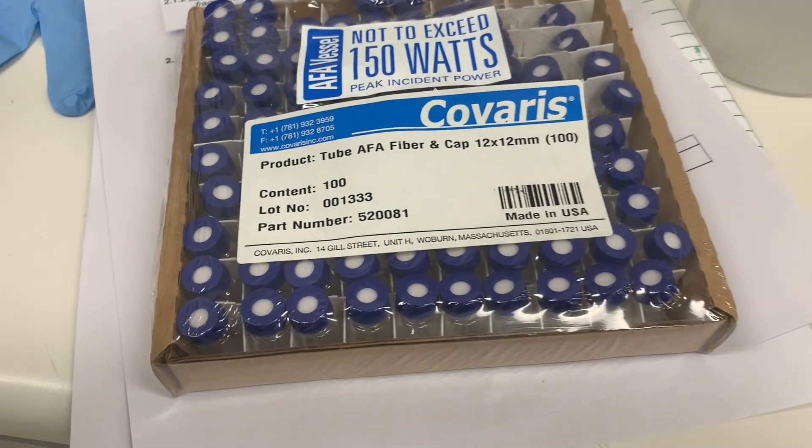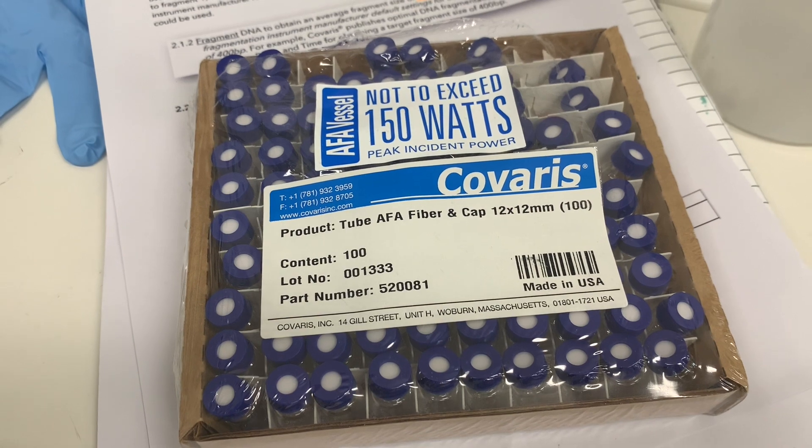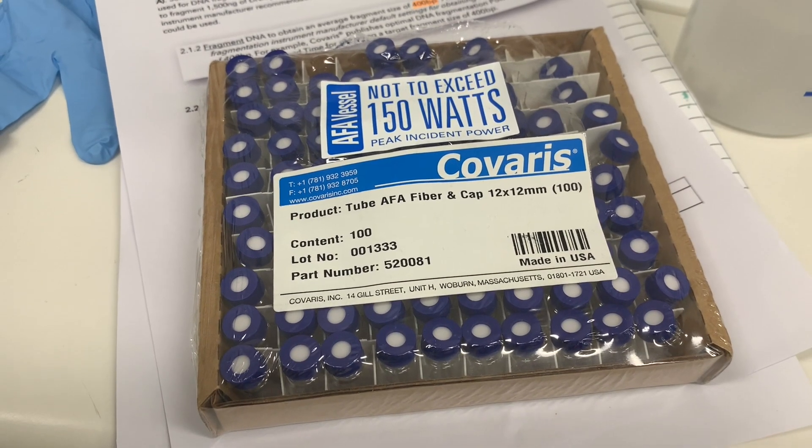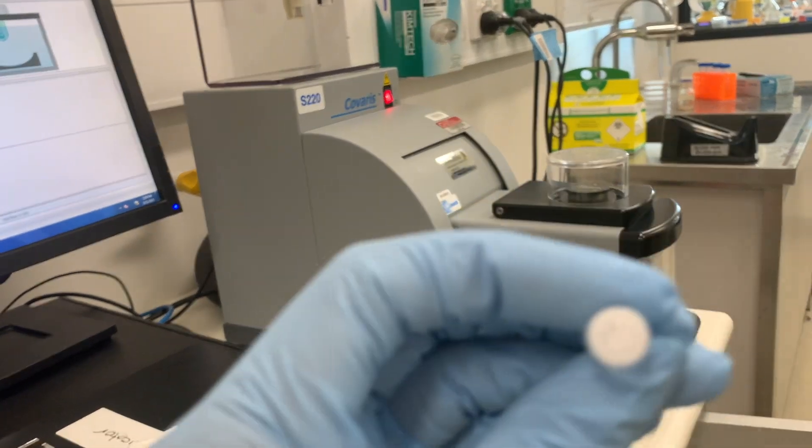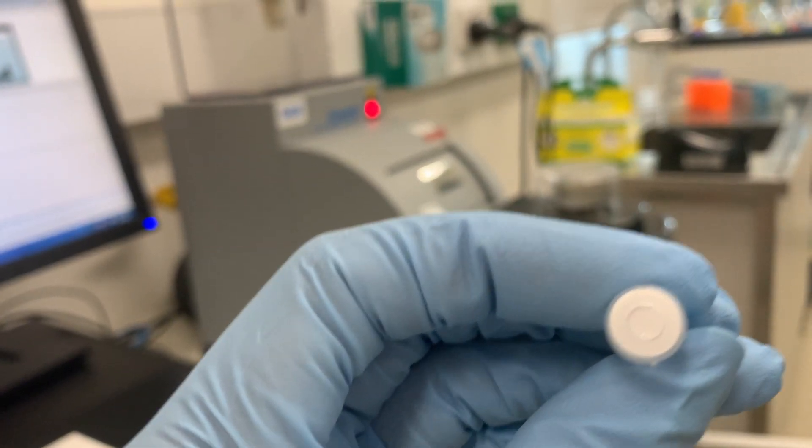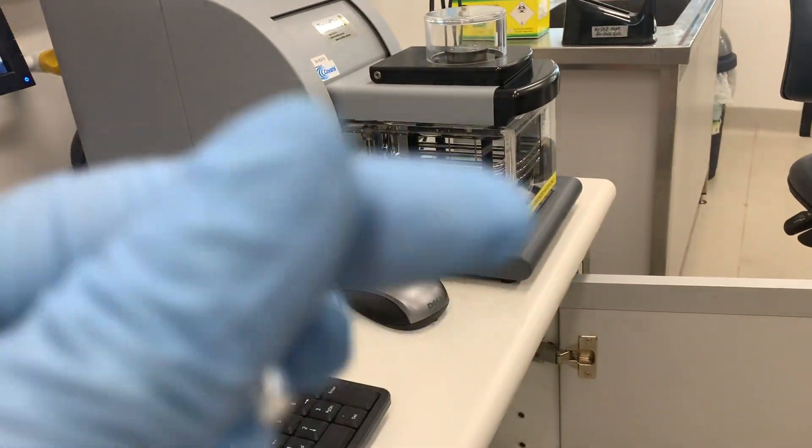The next thing you need is the right vessel for placing your DNA into. You may want 100 base pair fragments right up to 5000 base pairs, or you may actually want 6000 up to 20,000 base pairs, so kilobases worth.